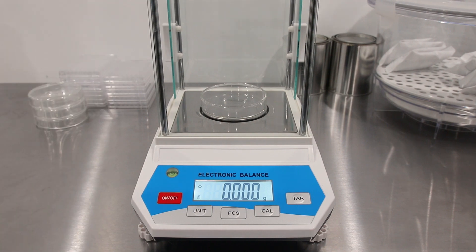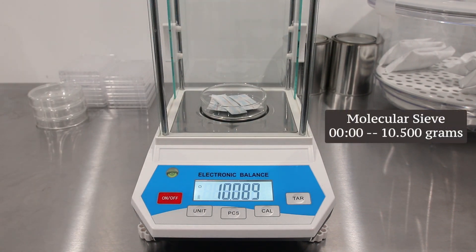Now for the packets of molecular sieve. They have an initial weight of 10.5 grams.